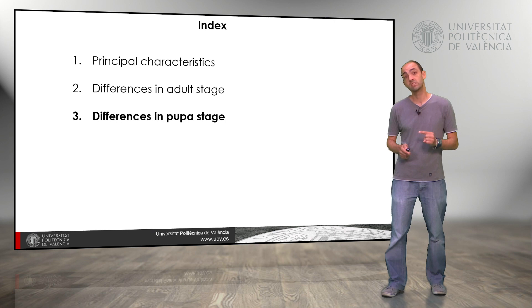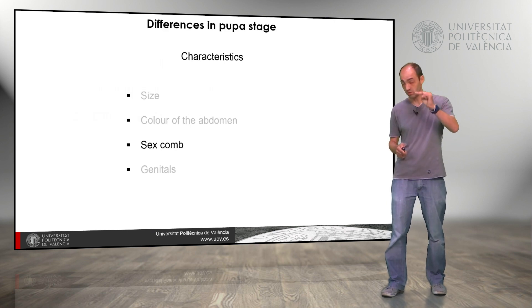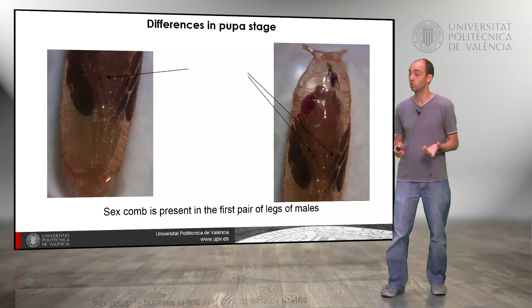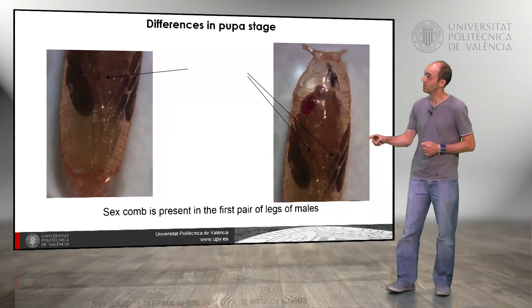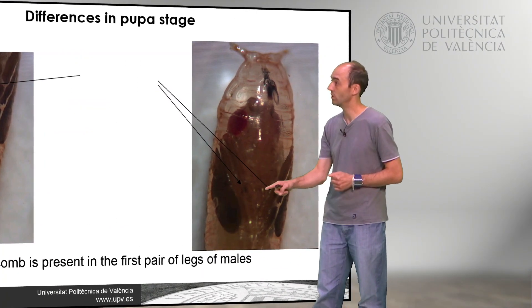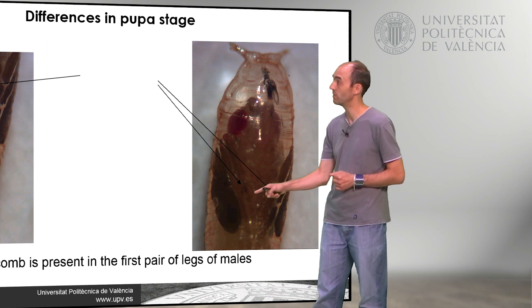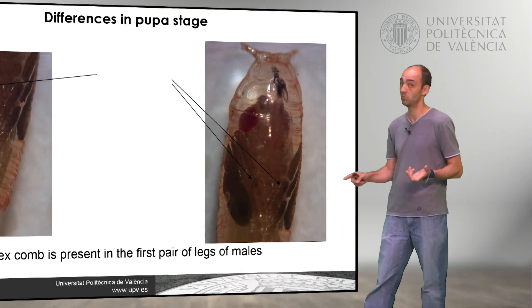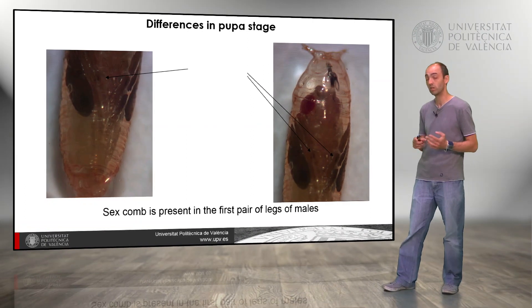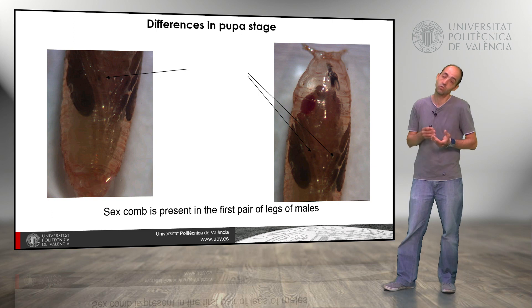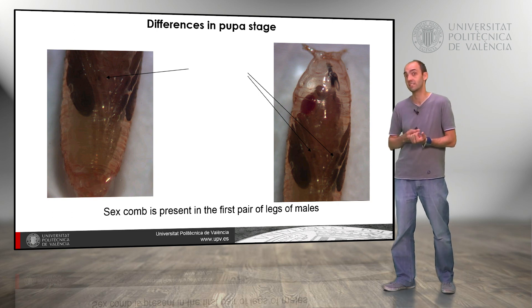The last step is to differentiate males from females in the pupa stage. We can apply the four differences from before, but the only one that is useful here is the sex comb, because the others are quite difficult to see at this stage. Here we have a pupa in the last stage of development. We can see the head, the wings, and in the middle of the wings we have the legs. If we see two black dots in the first pair of legs, we are looking at a male; if we do not see them, it is a female. We must choose a pupa that is in the last stage of development.